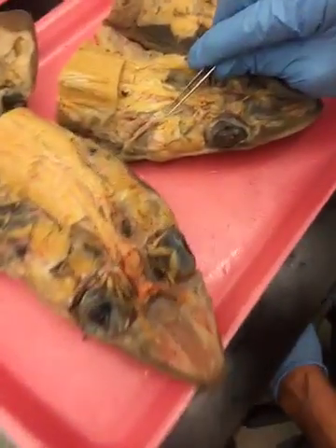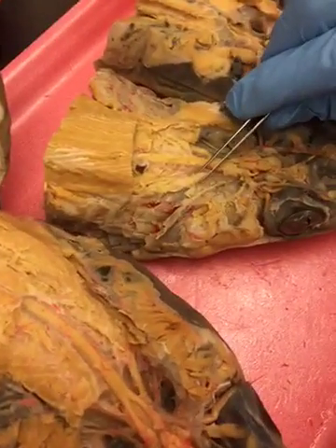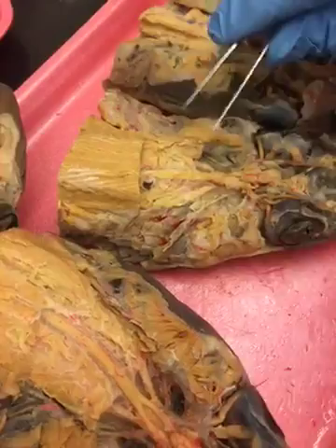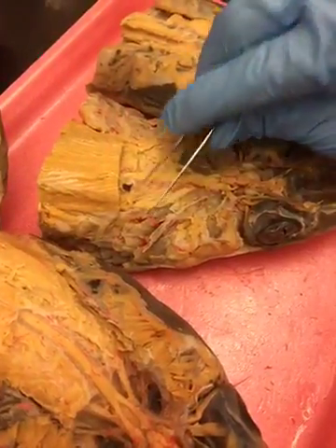So that's the glossopharyngeal, and that's the vagus, number 10, going to more gills. Now in us, it goes to the heart. Well, it probably goes to the heart in this too, but it doesn't go, and that's it.